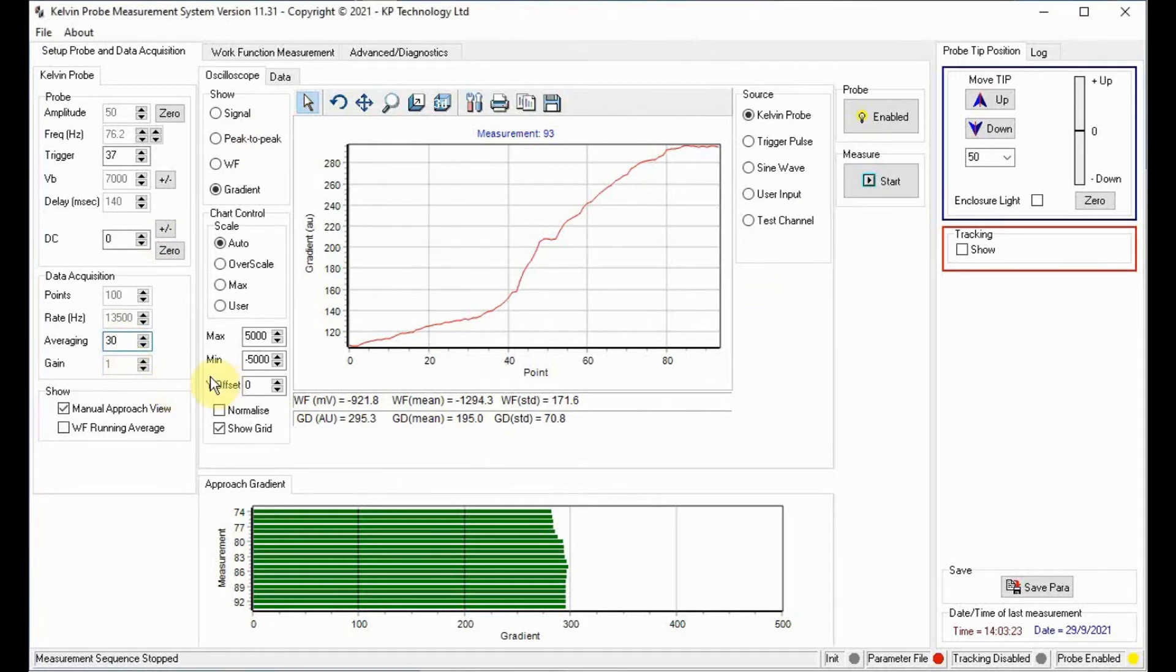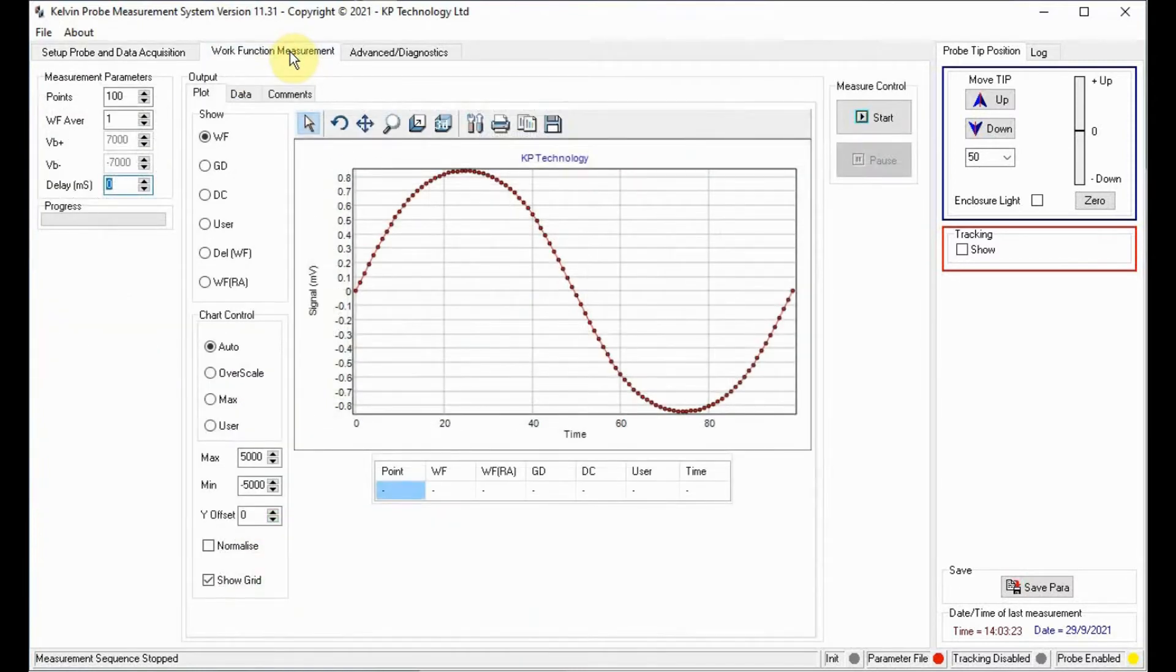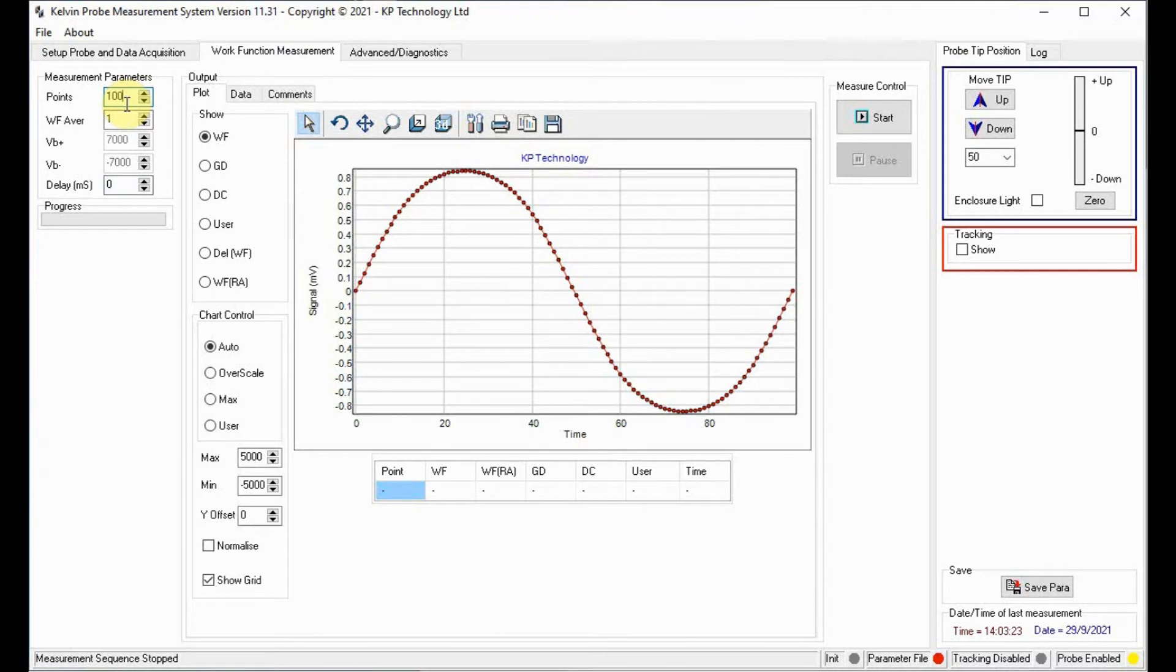Click in the work function measurement tab and choose the number of measurement points. In this case we will choose 100 points for demonstration purposes. Click start to begin the measurement.